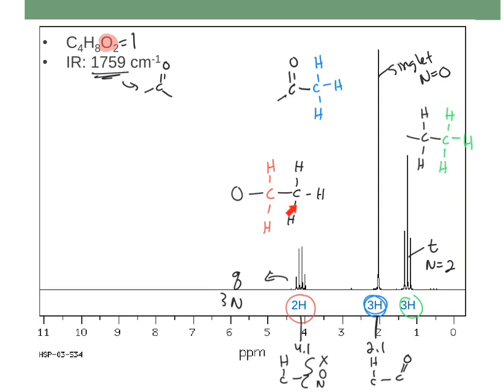So from each of these peaks, I was able to get this information. Now, if I take a look at this, right, I only have 4 carbons in my molecule, and yet I have drawn 1, 2, 3, 4, 5, 6 carbons. So clearly, some of these pieces are overlapping with one another. And if I take a closer look, I think it's these two. I think it's the ethyl piece right here and right here. So now I'm just going to put these 3 puzzle pieces together so that they make sense.